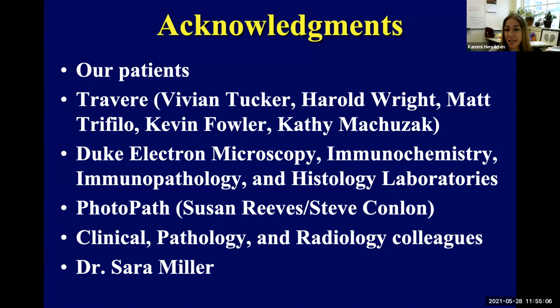Okay. A question about how swift is tissue transferred to fixative, and a follow-up with that, does the lag time in transfer of tissue into the formalin container alter the PAS stain? My technician complains of that often. Please clarify. Yeah, that's a good question. And I don't know the specific answer. I can tell you that we attempt to get the tissue into fixatives as rapidly as possible.